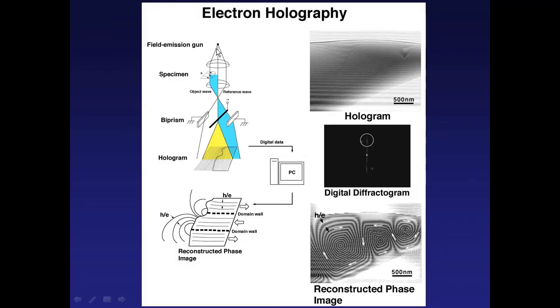And also, the electron beam has a higher coherency, so we can make a higher coherent electron holography. The specimen is here. The electron transmitted through the specimen has a potential modulation. The other side, transmitted through the vacuum, has no modulation. So both electron waves produce an interference fringe, the so-called electron hologram. This hologram contains the potential information. After phase reconstruction, we can make a potential distribution.